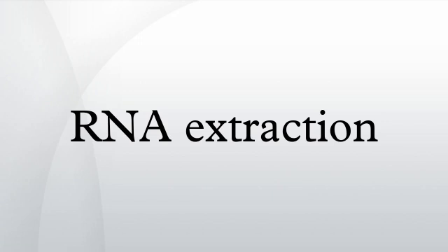For the same reason, experimenters take special care not to let their bare skin touch the equipment.